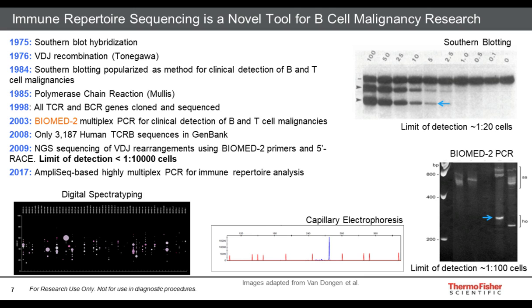And the key feature of this approach is that one can use many, many primers in a single reaction. So there's not the issue of primer-primer interactions that has historically made immune repertoire sequencing quite challenging. And so we are able to design primer sets that can amplify all of the known variable genes and alleles and thus provide comprehensive coverage of the immune repertoire.